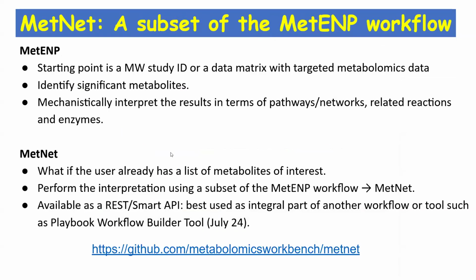Another tool that we have is called MetNet, which is essentially a subset of the MetENP workflow that I just described. The only distinction is that with MetENP, usually the starting point is a metabolomics study ID or a data matrix with the targeted metabolomics data, where we first identify the significant metabolites, and then mechanistically interpret those results in terms of pathways, networks, and related reactions and enzymes.